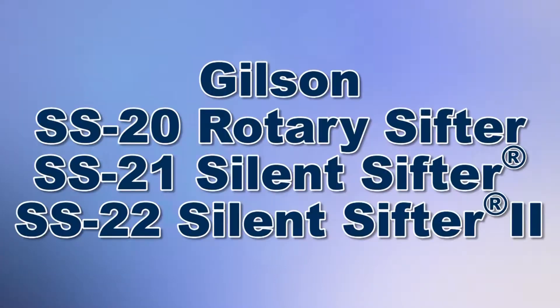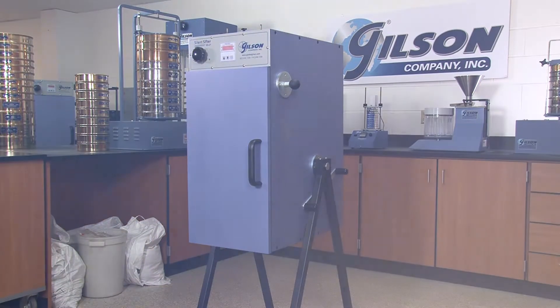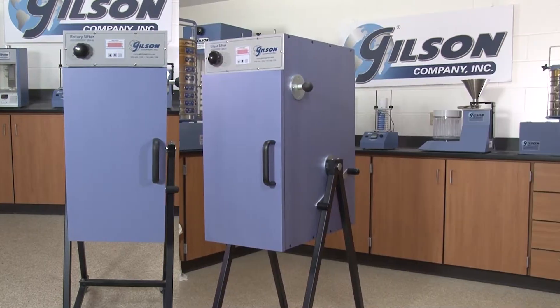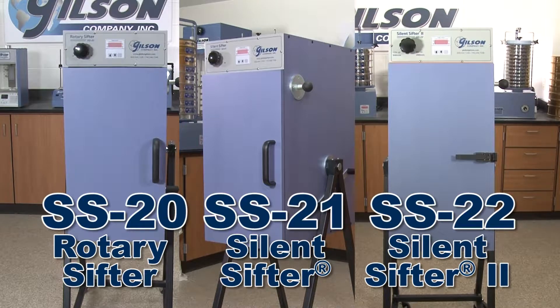When your high production testing lab needs to perform accurate sieve analysis on a broad range of particle sizes and material types, then Gilson is your best choice. Backed by Gilson's quality and reliability, the Gilson SS20, SS21, and SS22 rotary sifters offer advanced design and easy to operate functionality.